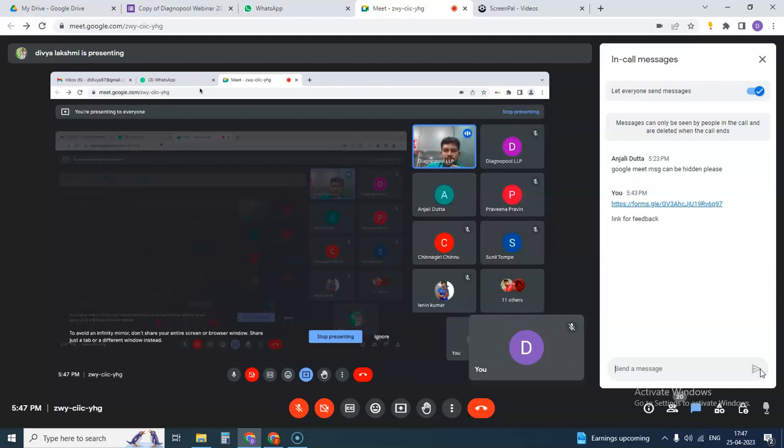Yes, Dr. Divyalakshmi, I would like to ask one question to all the technicians and doctors who are working in labs and are here. How is the liquid waste discarded in all the labs, especially in the labs which do not have a good effluent system or a good STP? Because this is a common question in the NABL audit, especially for small labs where it is not followed correctly.